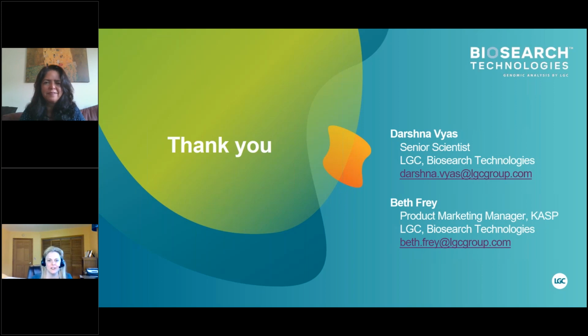Okay, we have a couple more audience questions here. I have used KASP in oats. Now I am working in mulberry. The reference genome is available with 22 genotypes. Resequencing is available. Is it feasible to use 25,000 SNPs with 700 genotypes using KASP technology? I would say it is absolutely possible, but I'm not sure it would be the most cost-efficient approach. There are alternative technologies that we have, such as SeqSNP, which probably would be more applicable in this situation.